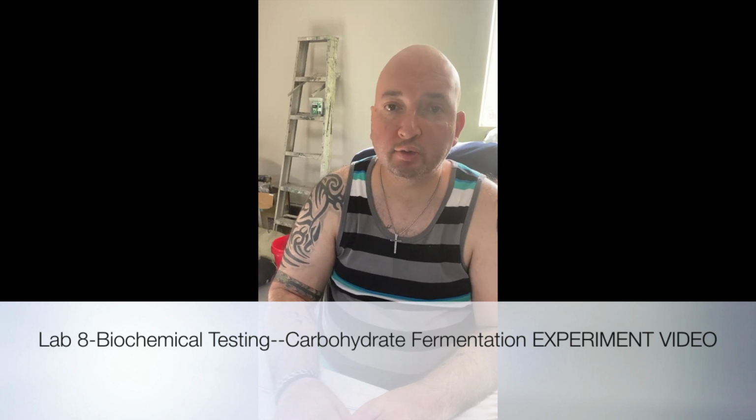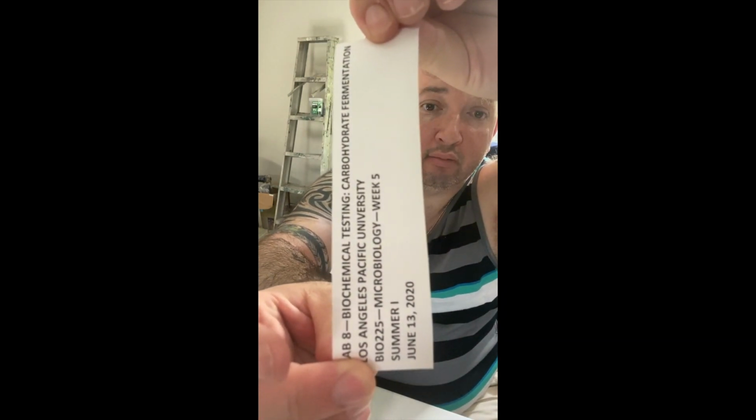My name is Ricardo Sandoval, and this video is for week 5 of Biology 225, microbiology at Los Angeles Pacific University for the summer 1 term. This is lab number 8, and this lab is entitled Biochemical Testing Carbohydrate Fermentation. And here's just a quick little sign I made about this lab.